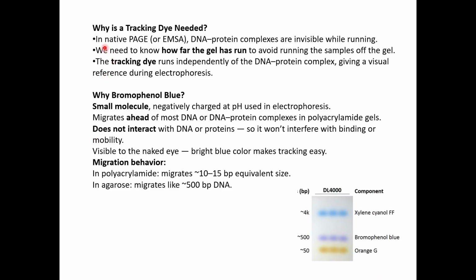So why is a tracking dye needed? In native PAGE or in EMSA or in any sort of gel electrophoresis, particularly in case of DNA, protein, and even DNA protein complexes, they are all invisible while running. So unless and until you add a coloring component like a dye, you cannot visualize your sample running in the gel, and you would not know whether your sample has completed its run in the gel or whether it has released from your gel outside.